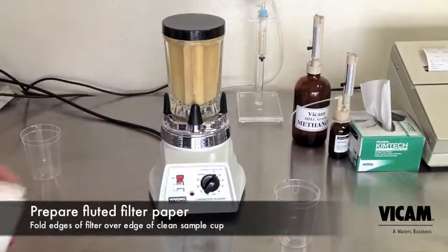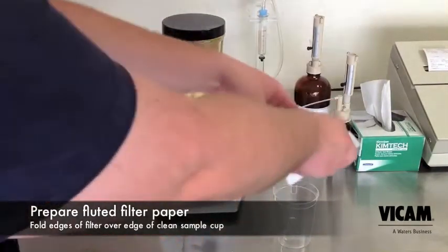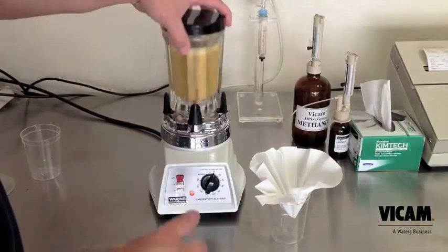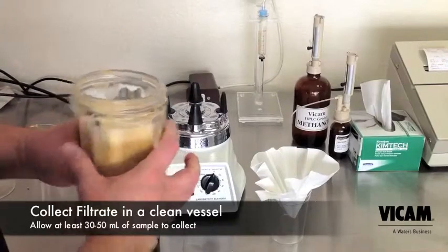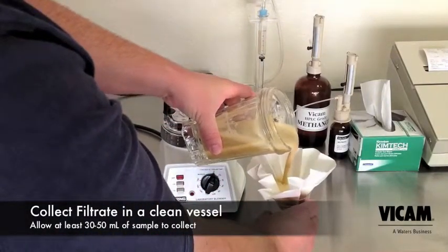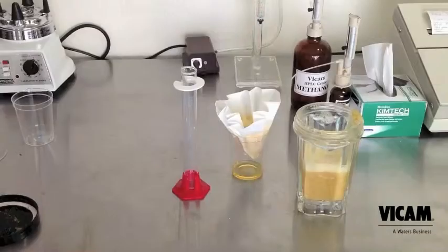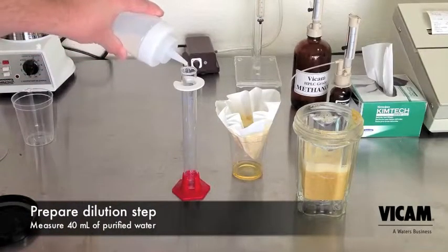Prepare a fluted paper filter by placing it into a clean collection cup. Next, pour your blended mixture into the filter and begin collecting the sample. While the sample filters through, prepare for your next step of the procedure.